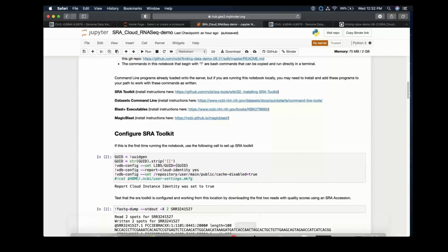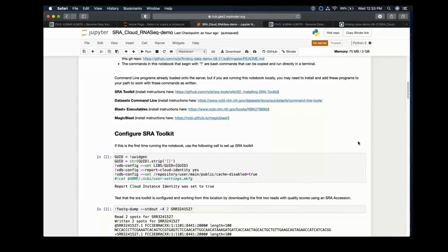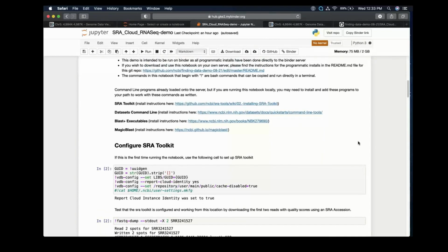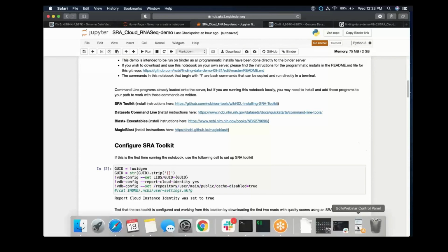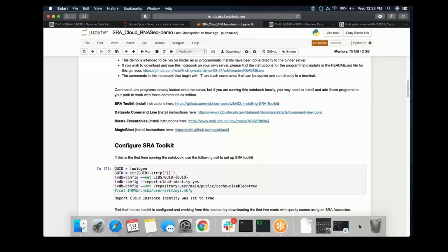Okay, and just in terms of the notebook, and I'll show you a slide in a minute that has the link on it too. The notebook file itself is in that FTP directory that I sent to you, including also the slides that I presented. Also, that's where all those BAMs are and the index files that Adelaide was loading. The other thing is that you can run this same notebook, if I'm correct in understanding this, by going to Binder and running it yourself there. Correct, Adelaide?